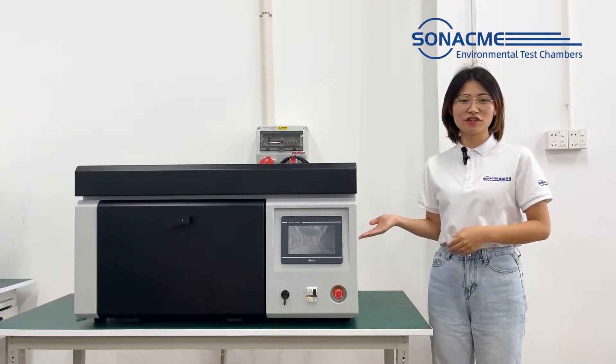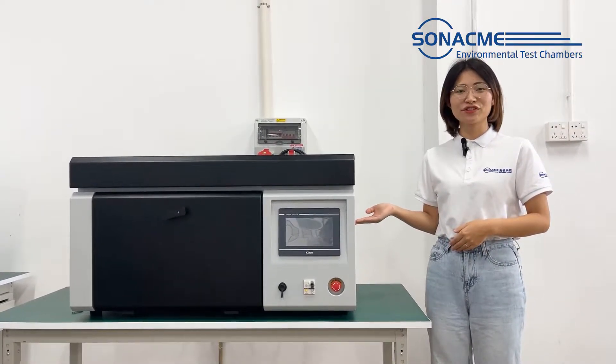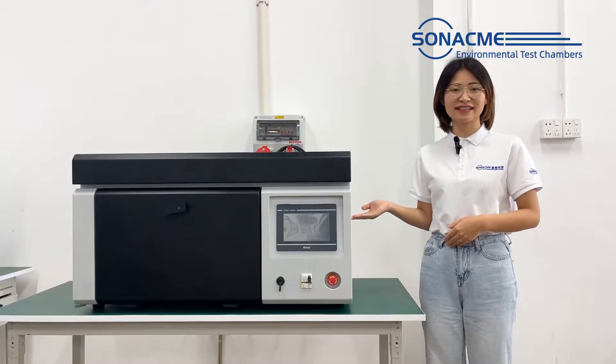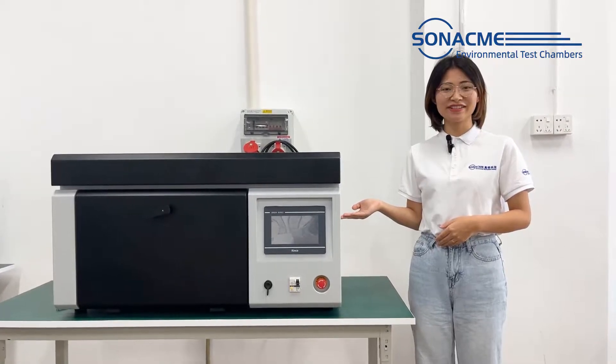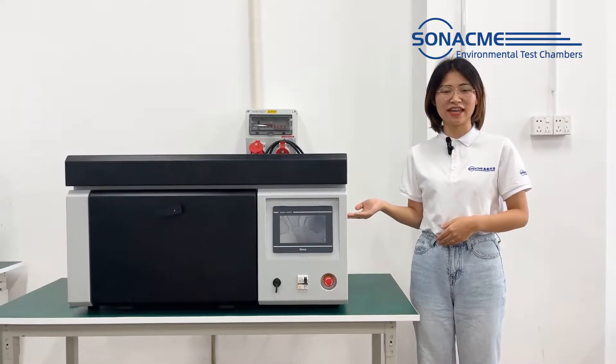This is our benchtop xenon chamber, specially designed for laboratory testing materials like plastic, rubber, paintings, coatings, and automotive industry aging tests.